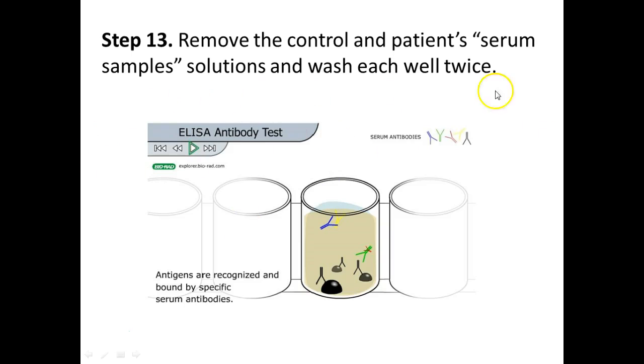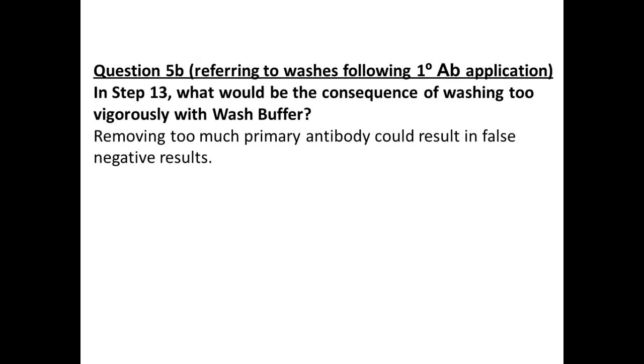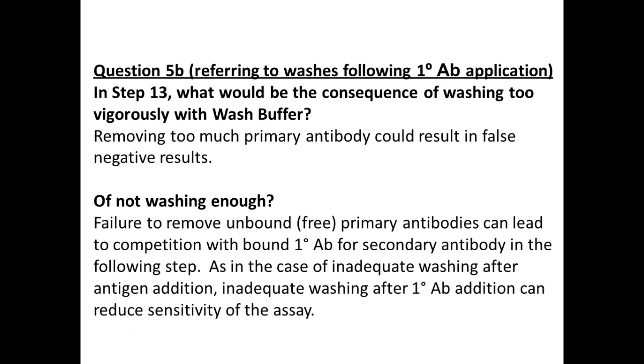So, as I said, we're going to wash, right? We're going to wash twice. Right? What happens if we wash too vigorously? We're going to wash out the antibodies, right? Maybe even the antigens. We'll end up with false results. If we don't wash enough, though, right, stuff is going to get left behind, can interfere with the next steps.